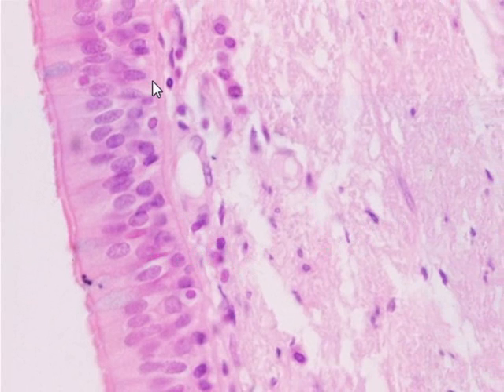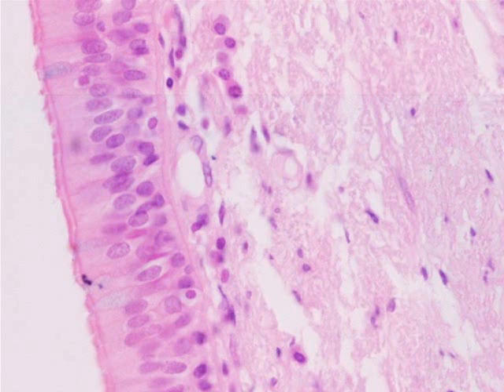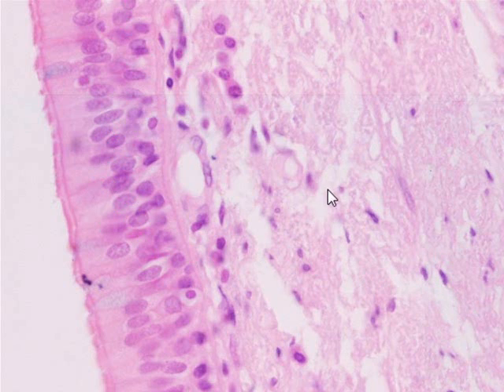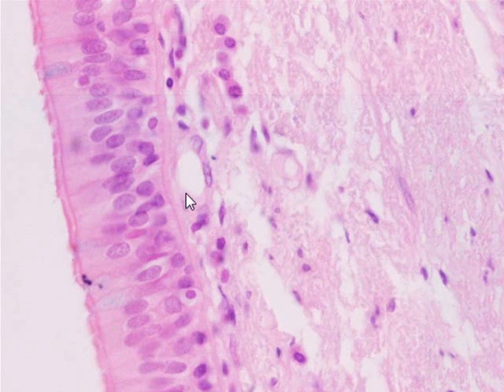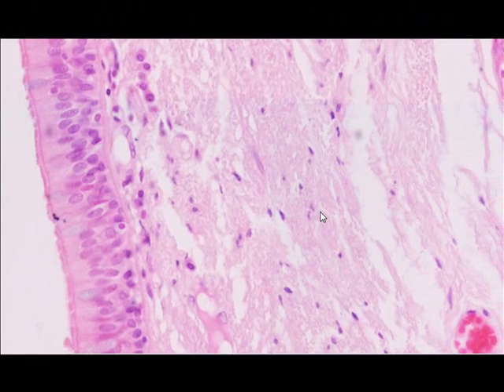As a rule of thumb, when the hematoxylin and eosin technique is applied to human or animal cells, nuclei appear bluish in color — you can see countless nuclei of cells — and the cytoplasm appears pinkish. The purpose of this exercise is to identify three or four main structures of a cell under the microscope.